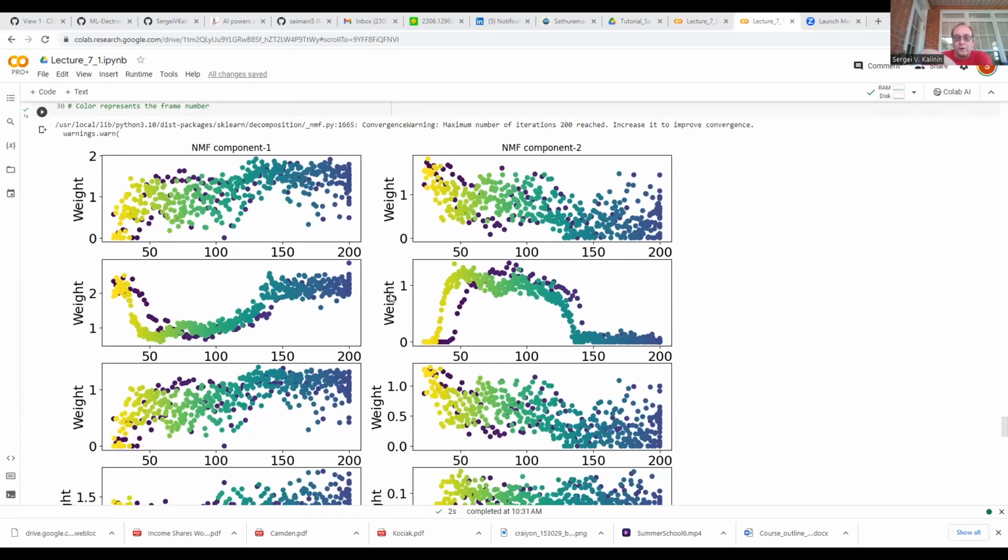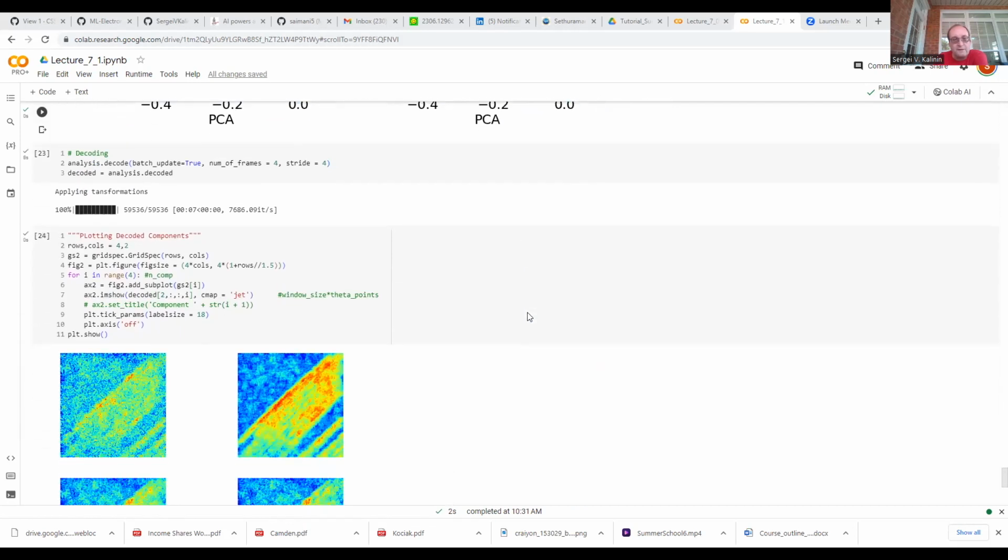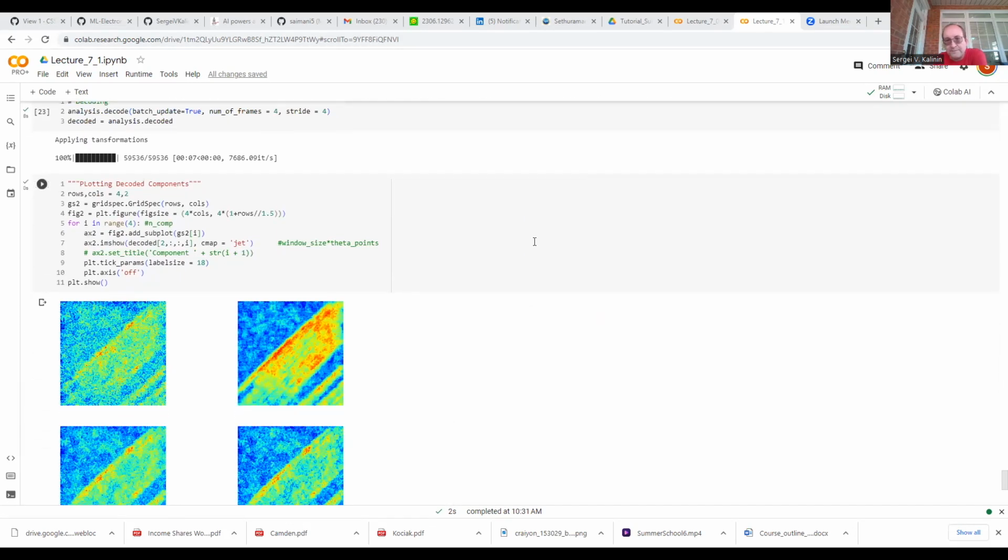So to illustrate what we are seeing here, all we have to do is to see the behavior of the data. One important thing is that the color here is the temperature. As you can see, we see a somewhat clear hysteresis between the two components, saying that actually both of the transitions have temperature hysteresis. So we start to see that forward and reverse curves are shifted with respect to each other. And again, we can explore the components and figure out what it means.